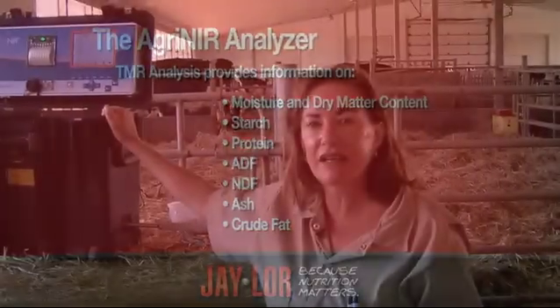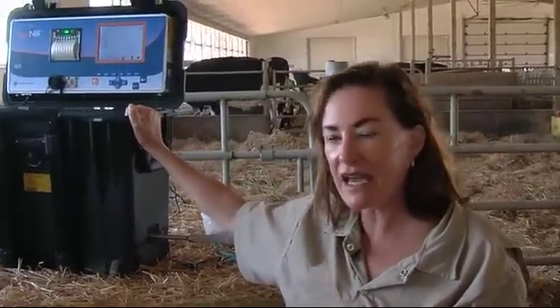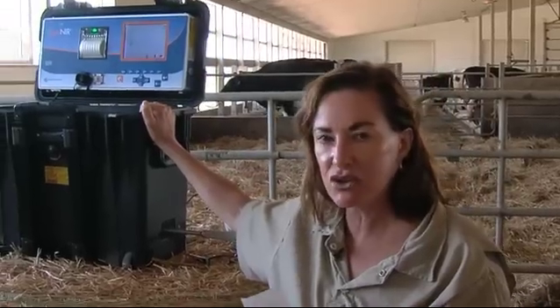This piece of equipment is the future for TMR feeding. It will fine-tune the ration on a daily basis. Getting your TMR finely tuned is important because nutrition matters.